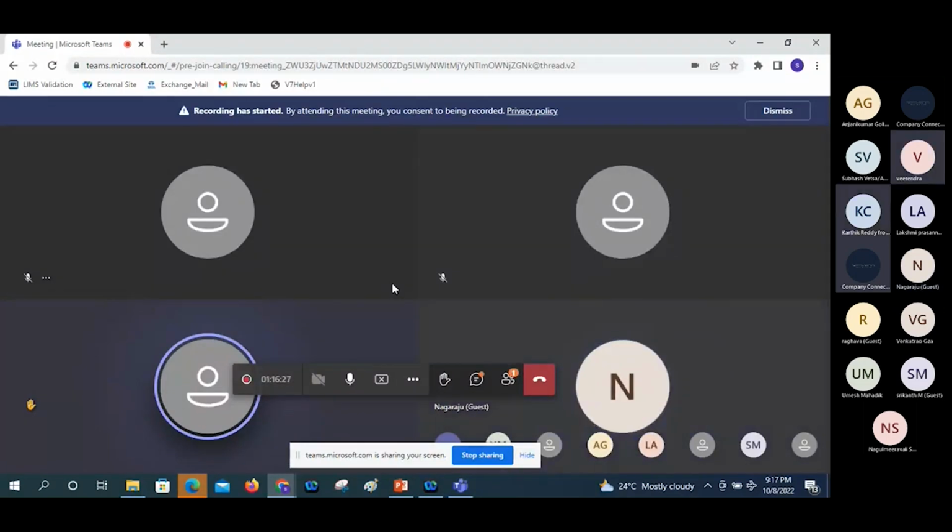See, within 1 minute, I can technically explain the answer to you. Here the complete LIMS administration activities would be user creation, modification, and obsolete group addition of that particular user who was relieved from the organization, as well as the data migration from one environment to another environment, some type of ad hoc queries, and complete master data creation for all modules. I will explain, okay, it will be more beneficial to you.